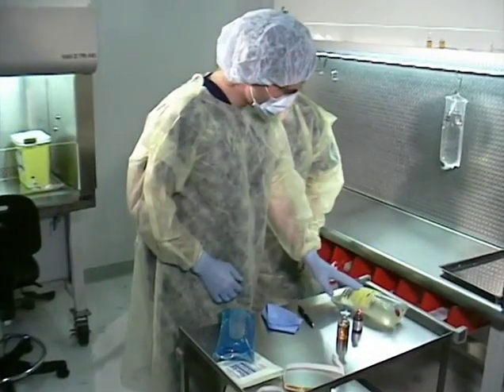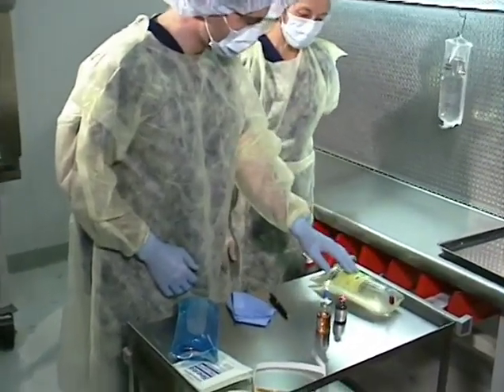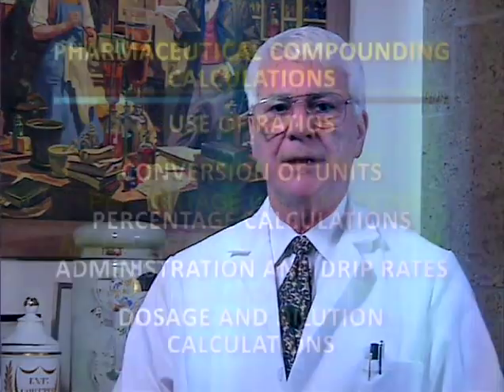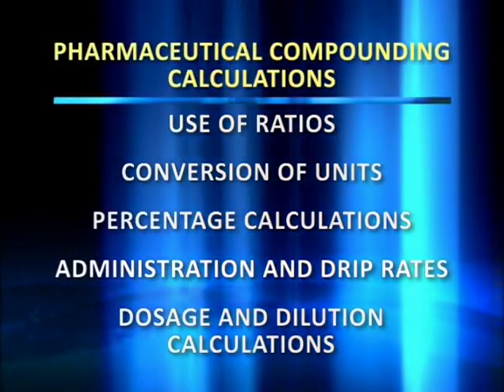Drug manufacturers must test product for the correct concentration of each drug component prior to release. Pharmacy does not have this method of ensuring that the correct amount of drug was used. Cross-checking of one another's work and computer-generated information is the final safeguard against potentially lethal errors.